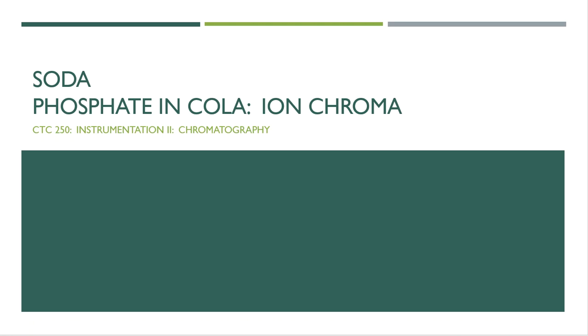Well, what we're going to be doing in this laboratory experiment, we're going to be looking at phosphate content, specifically in soda samples. And the question is why? Why do you want us to go through all of this, right? I mean, why waste our time running sodas in a laboratory and looking for something as silly as phosphate? Well, there's many things that we could be looking for in soda. Phosphate is just one of them. But phosphate's going to be the one that we're going to be focused on.